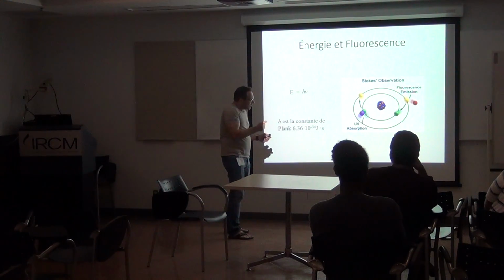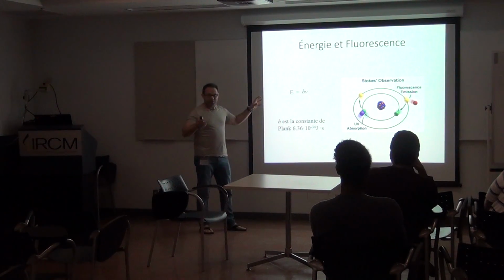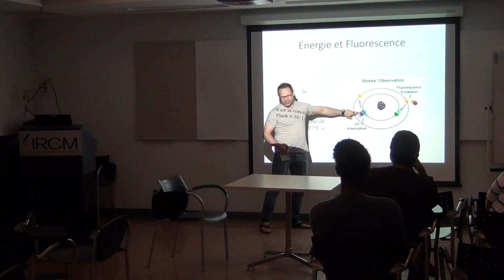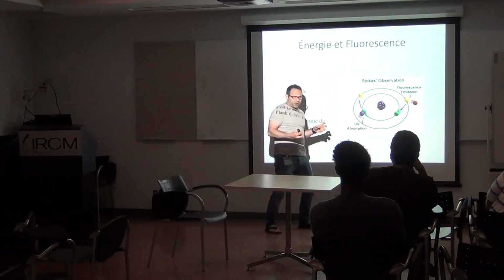It's so short that it's also subject to the uncertainty principle. So you don't know exactly where that molecule is. It takes a certain time to figure out that it has been absorbed.